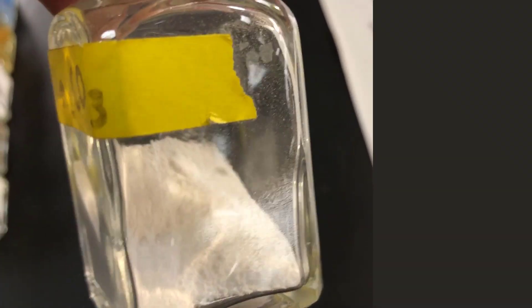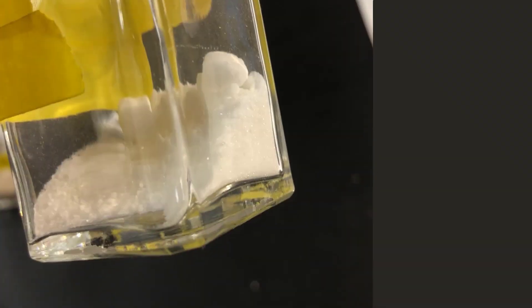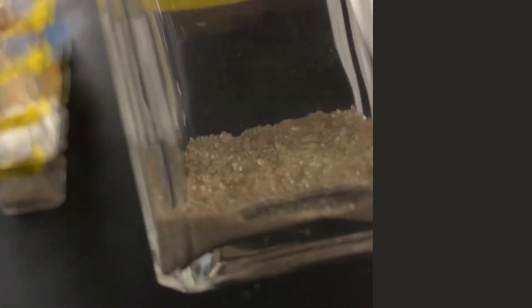So we're working with solutions here and the solutions are made from solid compounds dissolved in water. So what do these compounds look like before they're dissolved in water? So this is Na2CO3, this is Pb(NO3)2, this is AgNO3.